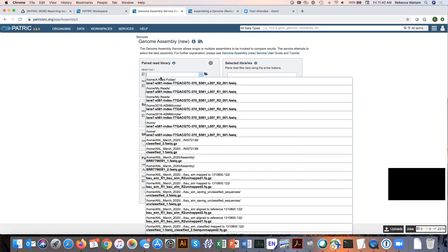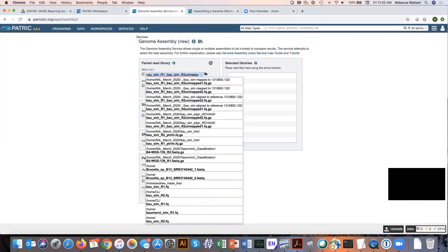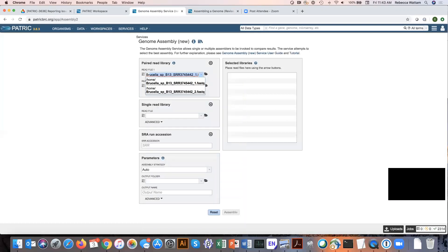However, if you loaded the reads a long time ago, you may remember what you called them and you can start typing the name. The autofill function in Patrick will try to find files with text that matches what you typed.